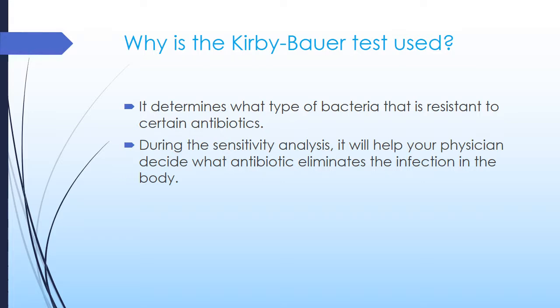Why is the Kirby-Bauer test used? It helps determine what type of bacteria is resistant to certain antibiotics. During the sensitivity analysis, it will help your physician decide what antibiotic eliminates the infection in the body.